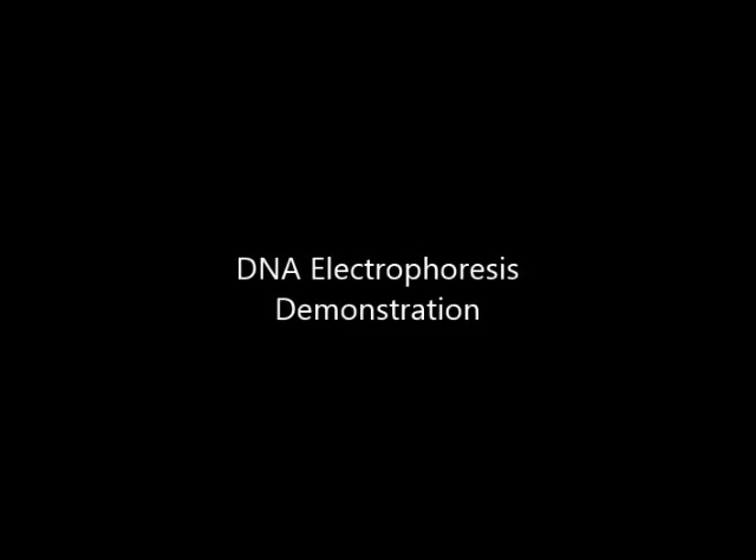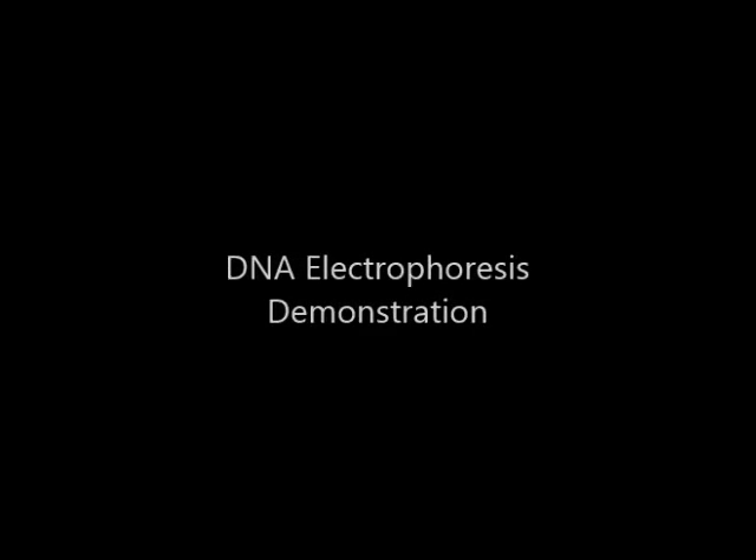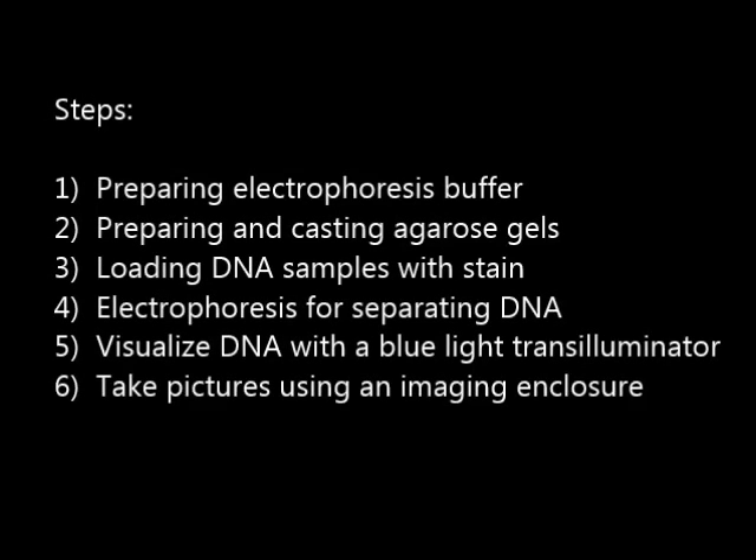In this video we're going to demonstrate the basic process of DNA electrophoresis. Steps will include preparing electrophoresis buffer, preparing and casting agarose gels, loading the DNA samples with a fluorescent stain, using electrophoresis for separating the DNA, using a blue light transilluminator for visualizing the DNA in the gel, and finally taking pictures using an imaging enclosure.